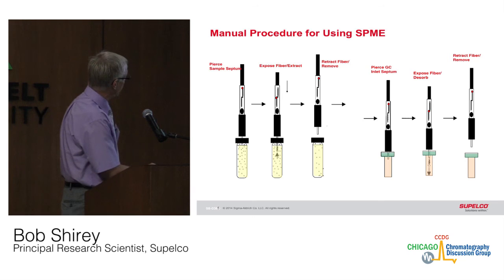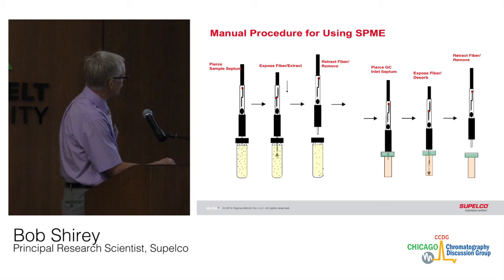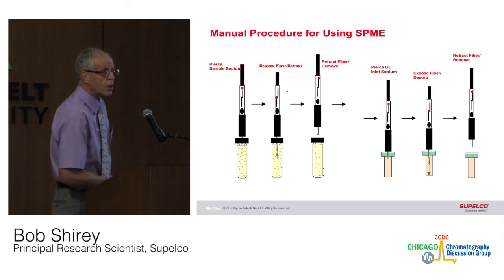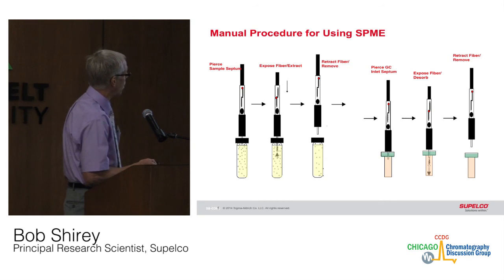So basically, you would insert the fiber and expose it to the sample or the sample headspace. After a given amount of time, the analytes migrate onto the fiber. You would retract the fiber, take it over to the GC inlet, pierce the septa, and expose the fiber. The heat of the injection port and the flow of the gas push the analytes onto the column. After a few minutes, the fiber is clean, it can be retracted, and the holder can be taken over to another sample to start the extraction process all over again.